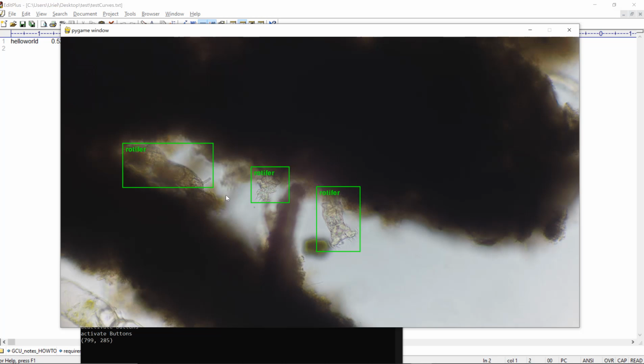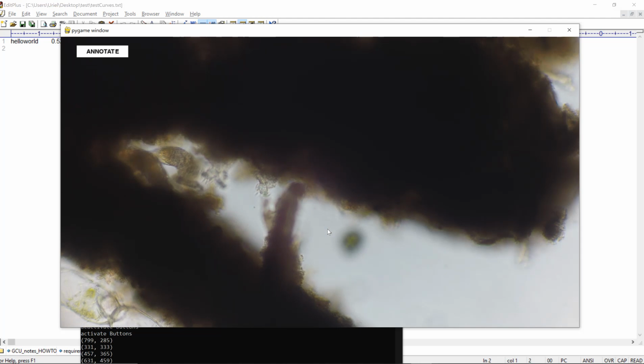So this is called the rotifer, and I don't like it either. So I right click on it and I can remove it. I can remove everything. So let's keep it right. I set this rotifer value here, rotifer and rotifer. Once I'm ready and I'm sure that the labeling is appropriate, I press D for done, and the program will save the information into their particular folders.